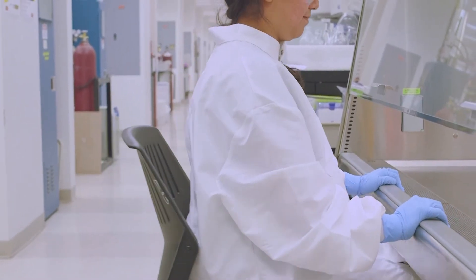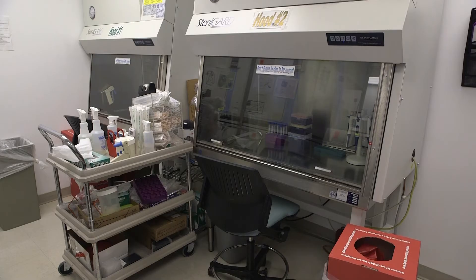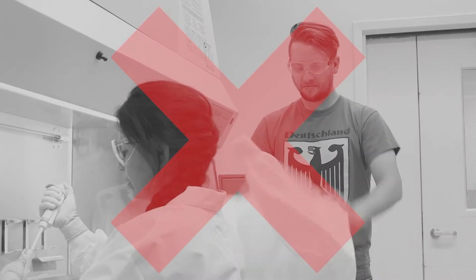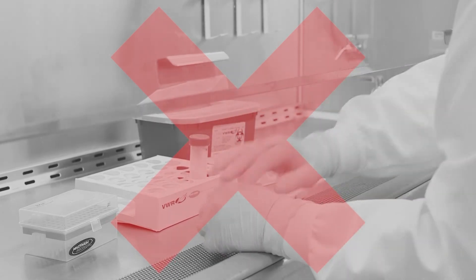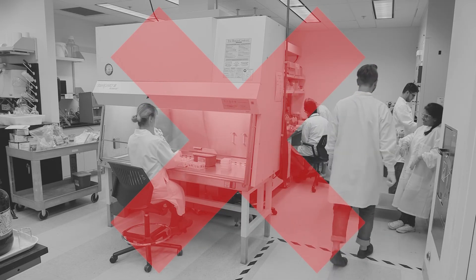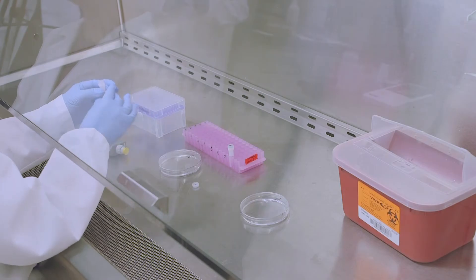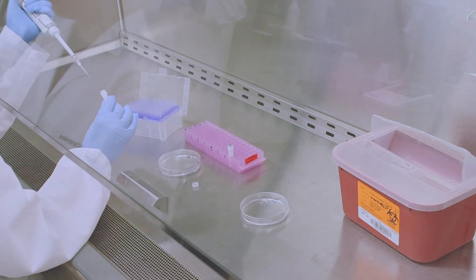Before beginning work, limit access to the area around the biosafety cabinet to minimize disruption of airflow, airborne contaminants, unnecessary distractions, and talking. Conduct work by following good aseptic techniques. Avoid sneezing, coughing, or talking while working in the biosafety cabinet to minimize the spread of airborne microbes. Always make measured, controlled movements to avoid airflow disruption. Avoid extra movements such as getting up from the cabinet during work or adding or removing materials in and out of the cabinet.